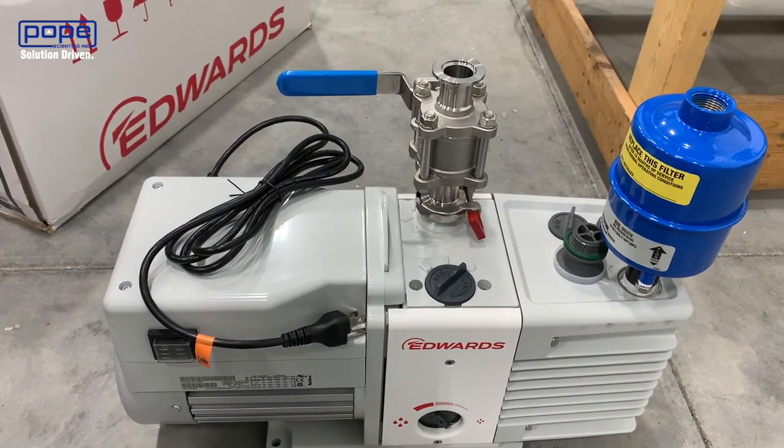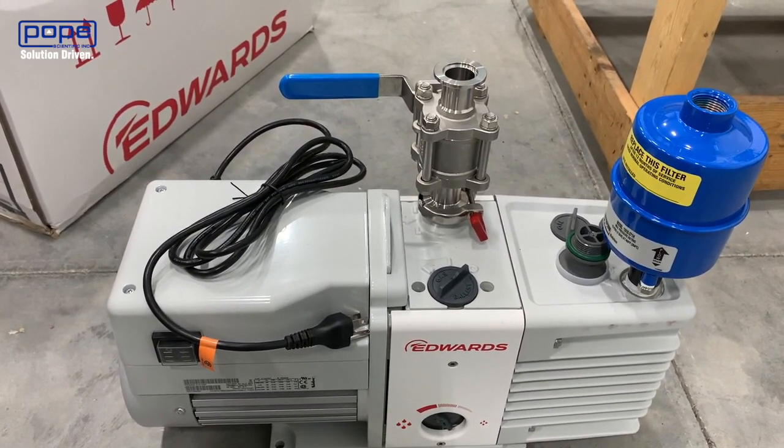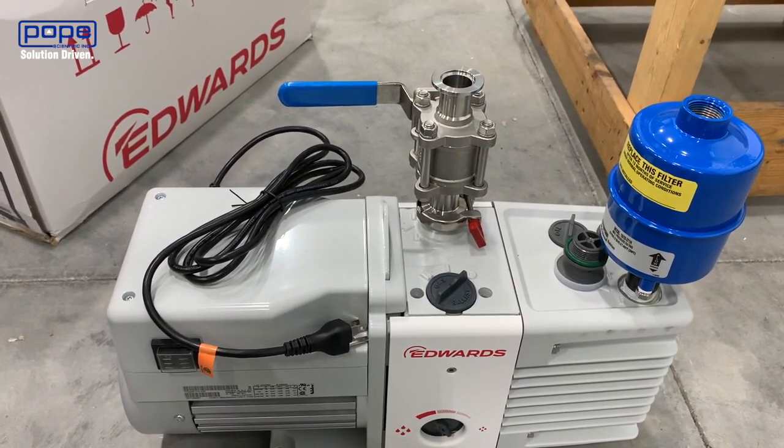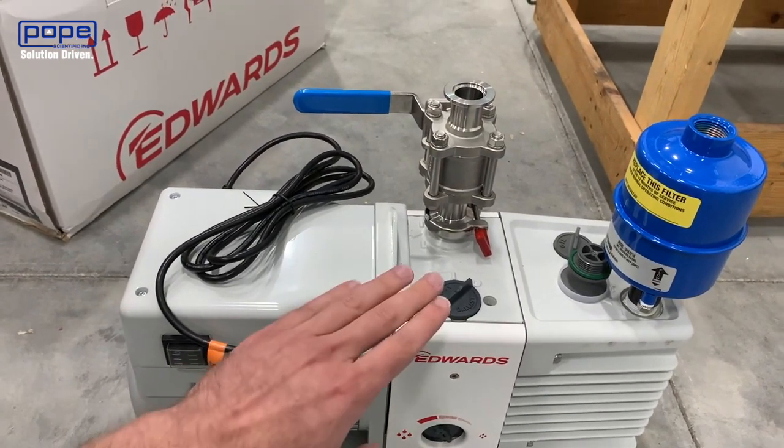How you can combat this and lengthen the life of your oil is by using the gas ballast. On smaller Edwards rotary vane vacuum pumps, your gas ballast is going to look just like this.